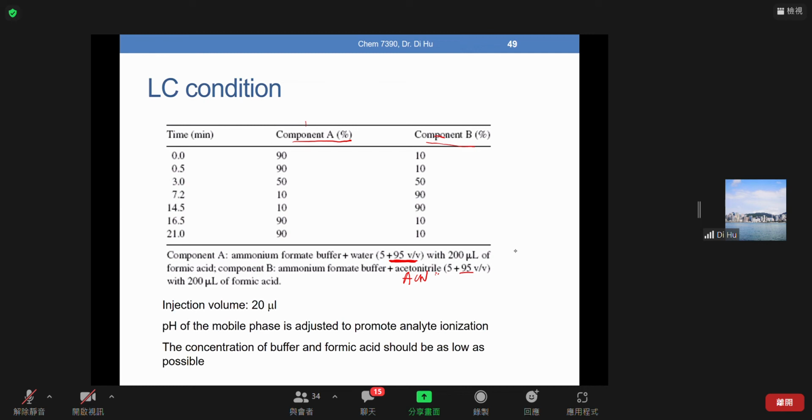And for THF, what is the limitation? You don't want to use too much THF, right? If you are using THF in an experiment, John will be mad. Why? Because THF is corrosive. It can degrade pump seals. Okay, it's really bad. And along with some of the PEEK tubing and fittings, they may block the system and cause very high pressure. So if we can have other choices, we try to avoid it, but you can be careful.